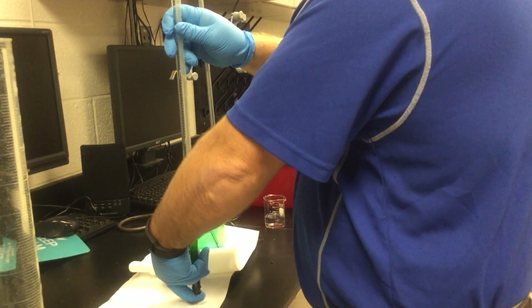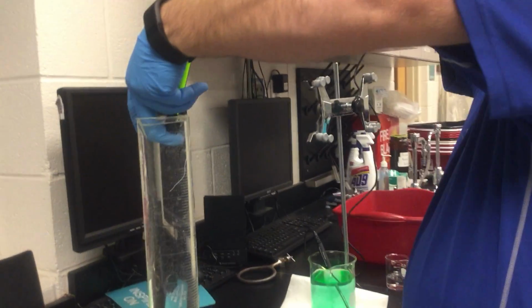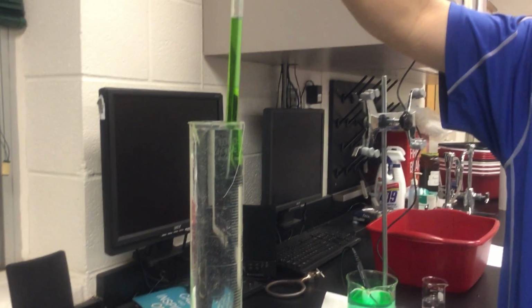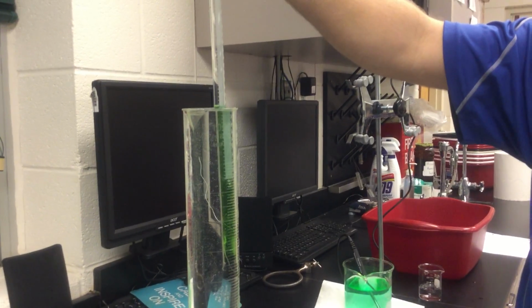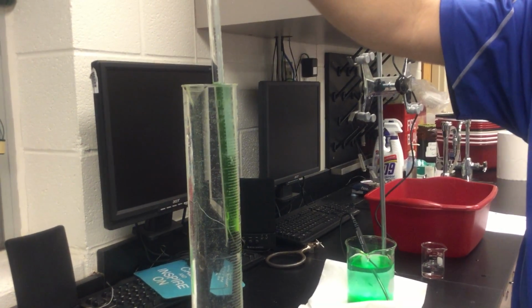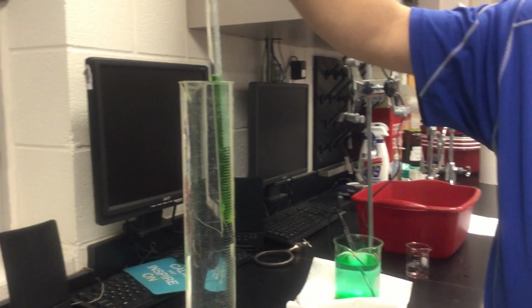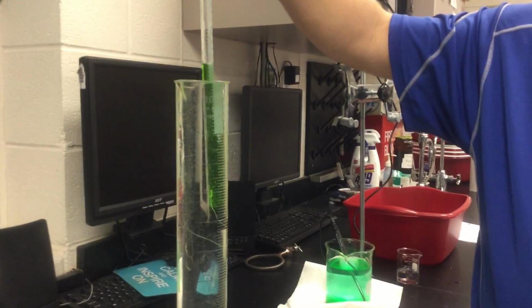Now, what I am going to do is I have to put this into here because I need to get this level of the water at the same level that I have in the tube. Why? Because I need the pressures to be identical. All right? Come up here. Somebody come up here closer.